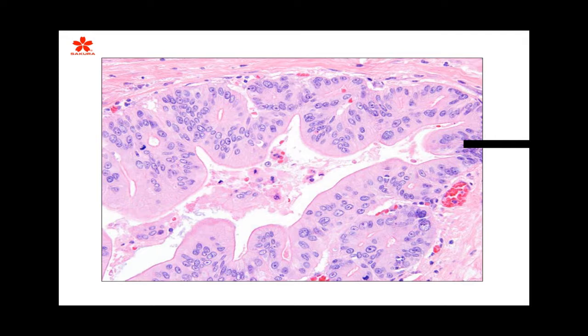So the next slide, and these are going to take a while coming through because they're all images, so I'm going to rapidly race through them as they come through. Once again, the slides that I'm about to show you now are optimal staining, or what would be considered as optimal staining. You can see the very sharp, crisp nuclear detail in these slides. So you see the nucleolus within the nucleus.